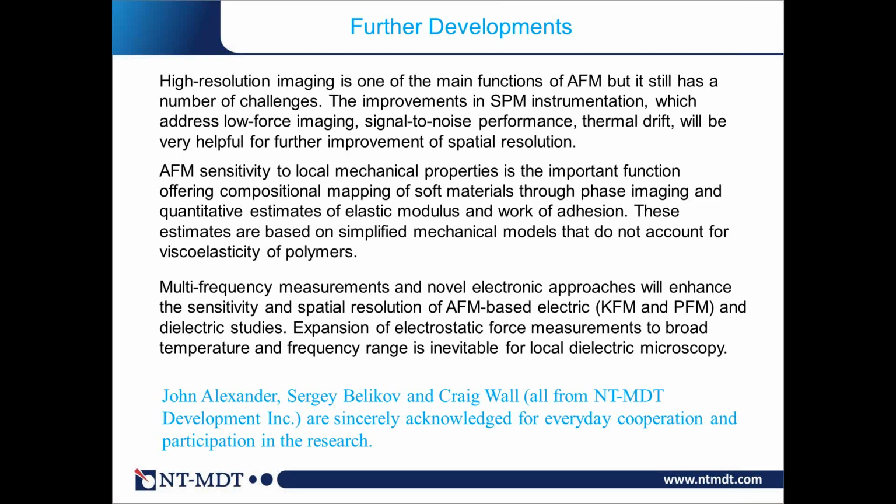This is also the challenge of the KFM. There are some other methods which people use, optical interferometers, which can do this job better than AFM instruments because they are more suitable to this work. They don't need extra calibration of optical sensitivity. They have lasers which are focused on the tip better, but again, that's separate measurements.